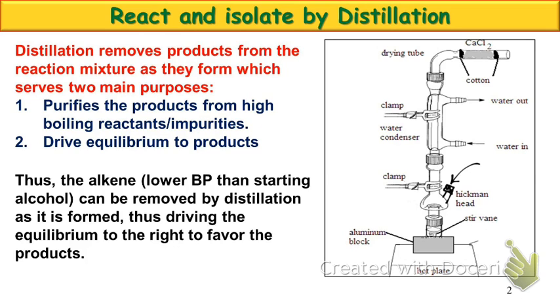So let's take a look at this. You've got your reaction occurring in the conical vial at the bottom of this flask.